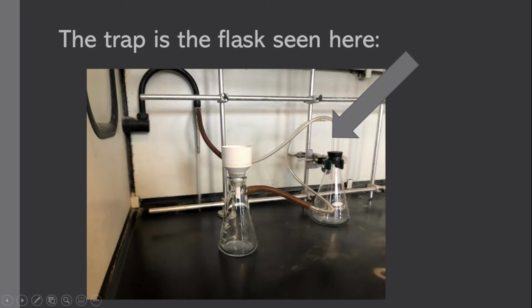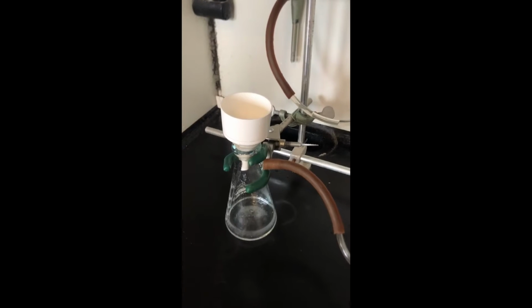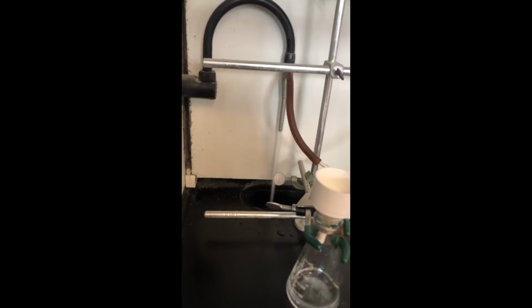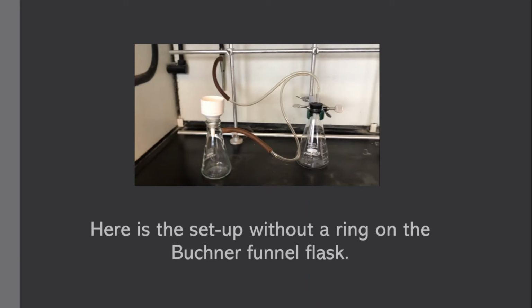You can see the trap here, the flask with the arrow pointing to it. And this is the best setup apparatus. It shows it with the clamps on both flasks. For the purpose of this video, I removed the clamp from the Buchner funnel flask, but best practice you would not. I only did that so that I could tilt around that flask to properly demonstrate what was inside of it. And here's the setup without the clamp on the Buchner funnel flask.